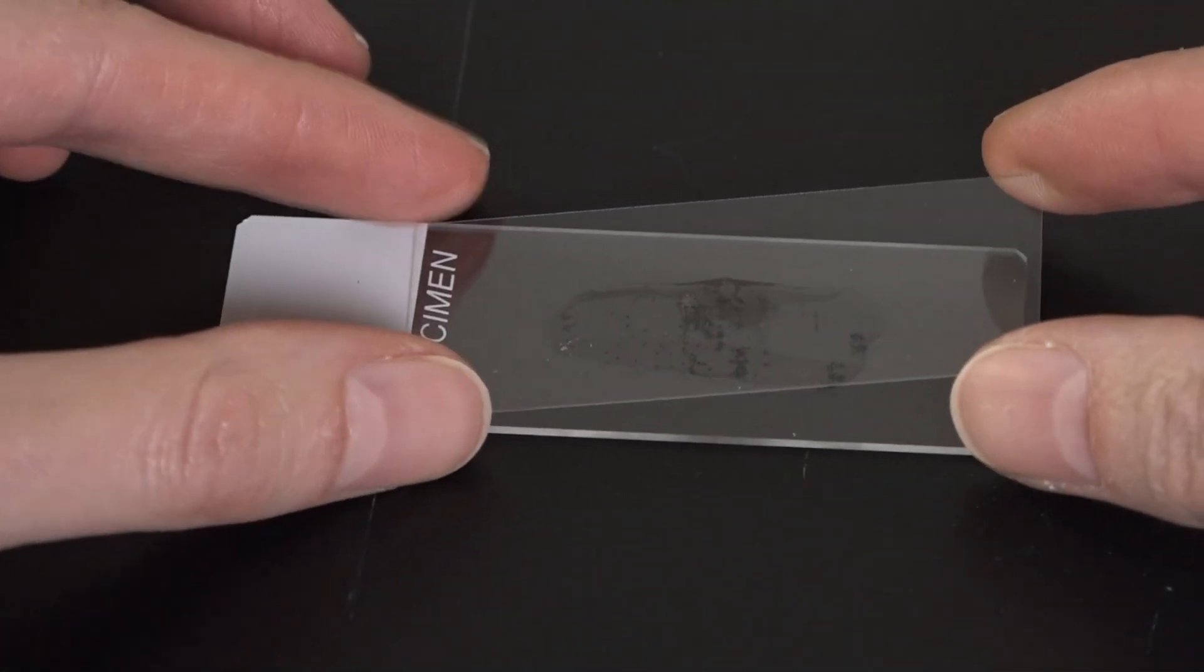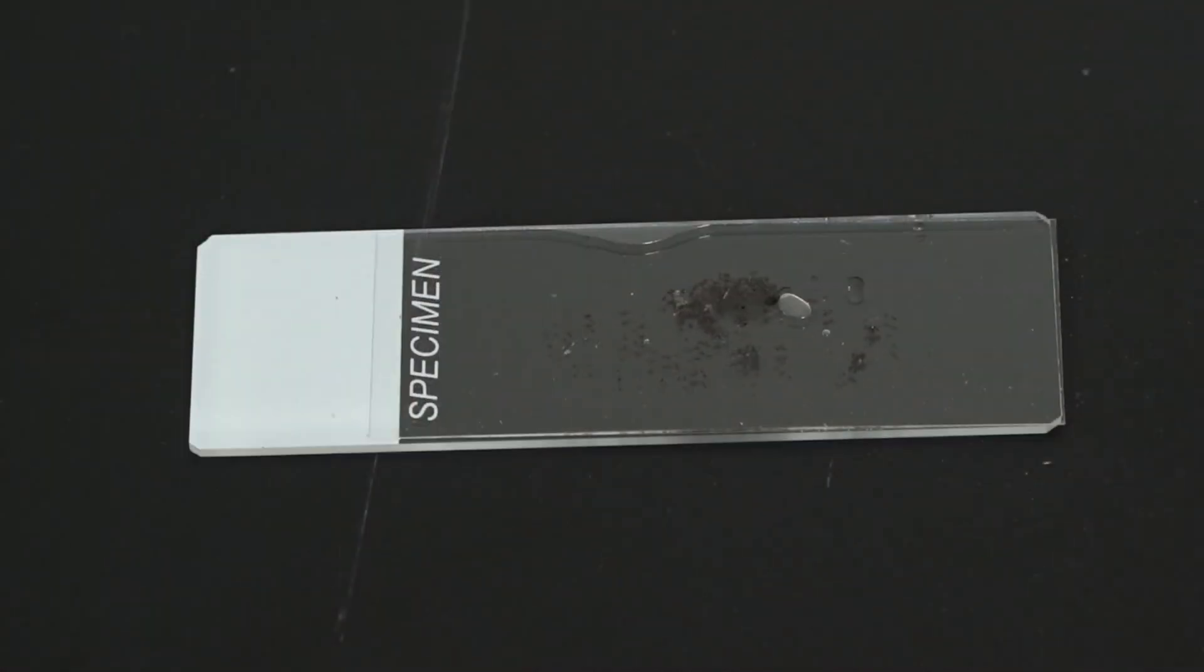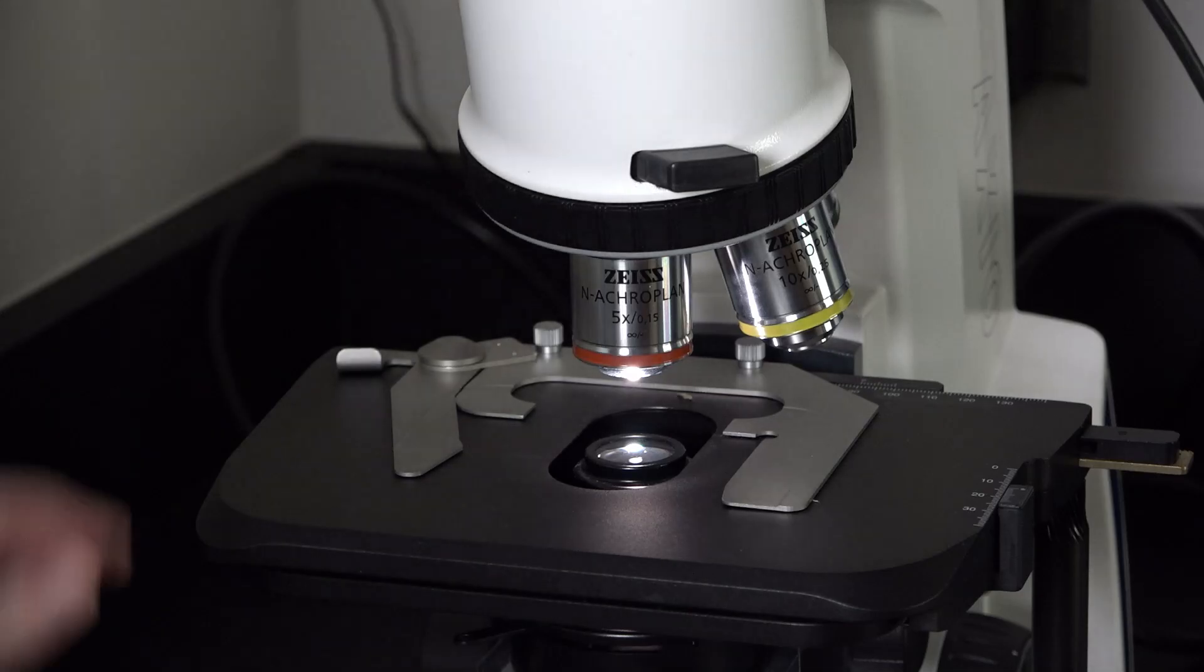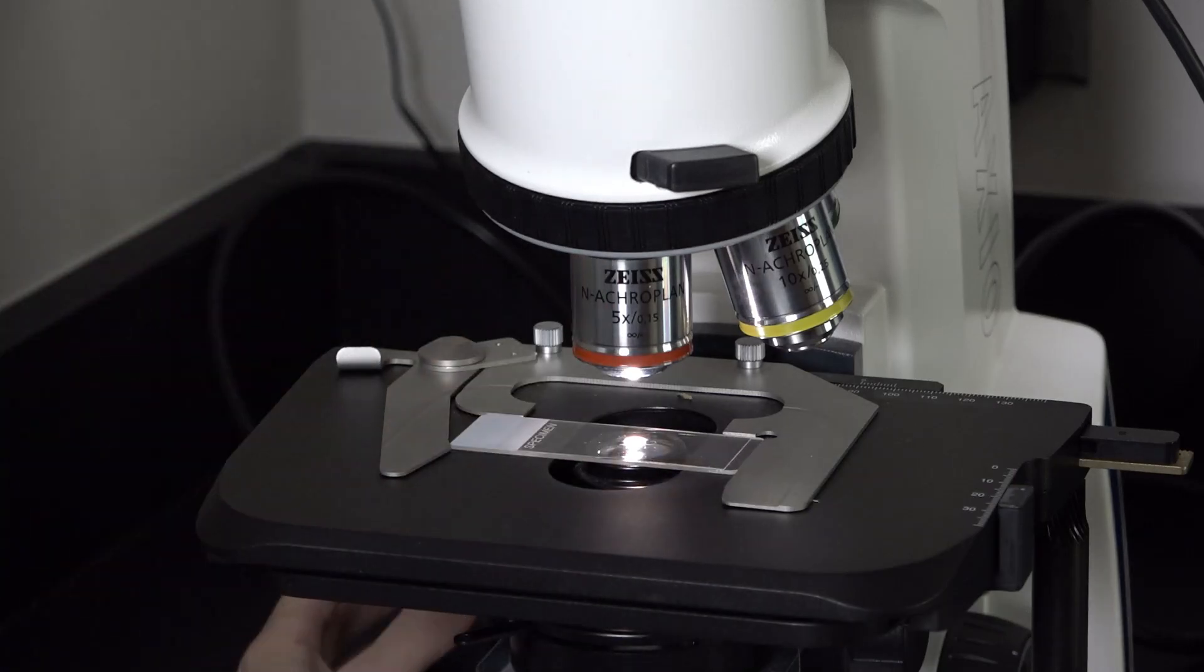Next, I'll put a cover slip over the perithesia and gently tap the cover slip with the pencil eraser to squash them and release the asci. Now it's time to observe my slide under the light microscope.